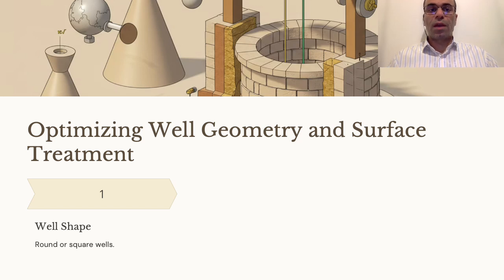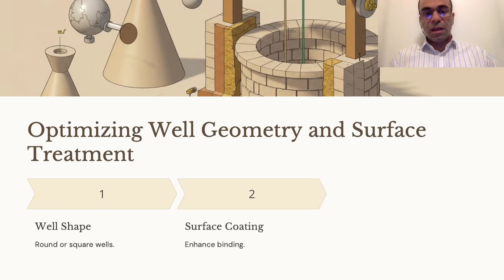Well shape. Round wells provide uniform fluid dynamics and even distribution of reagents. Square wells maximize surface area and accommodate larger sample volumes. V-shaped bottom and U-shaped bottom designs facilitate the plating and minimize dead volume. The shape selection impacts mixing efficiency, binding kinetics, and light scattering properties.